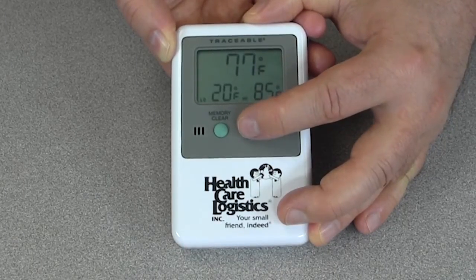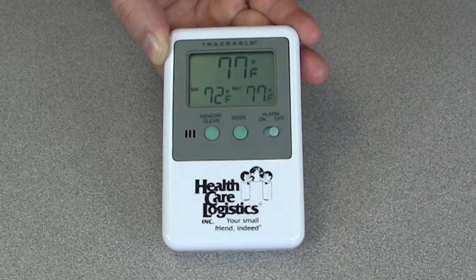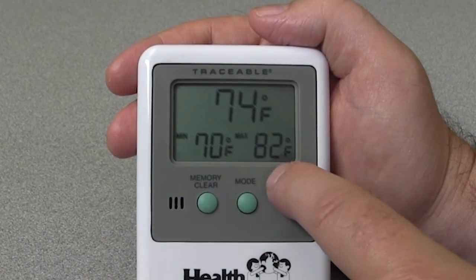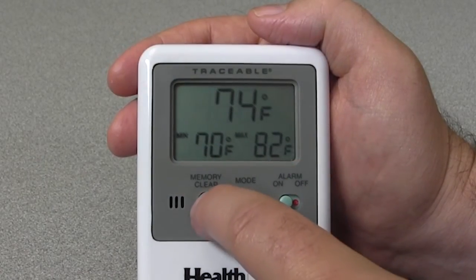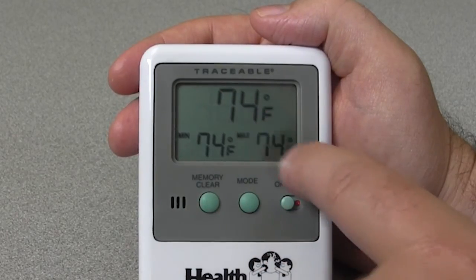Press the mode button once more and you'll return to the monitoring status on the device, showing you the current temperature along with the low temperature reading and high temperature reading. If you wish to reset the low and high temperature readings, simply press the memory clear button and when you release you will find that these markers are reset to the current temperature.